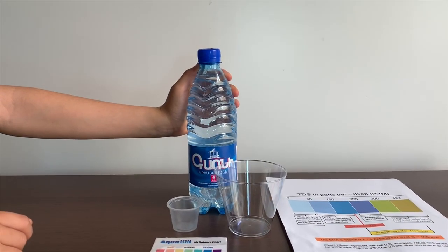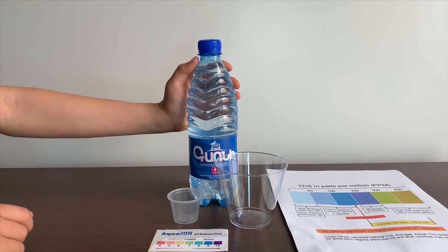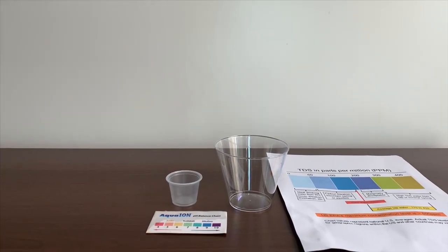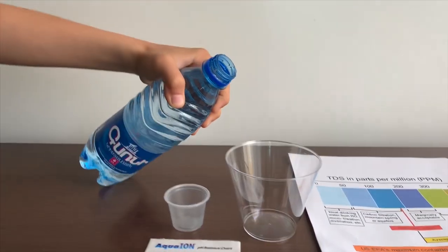This is Garnini's natural spring water. We got it from Armenia. Let's test the pH and TDS levels. Let's pour some water in.